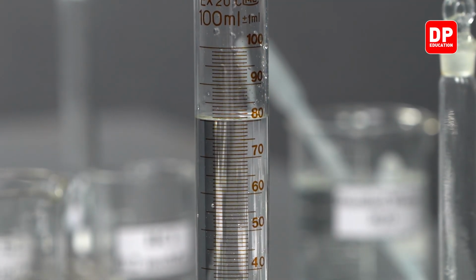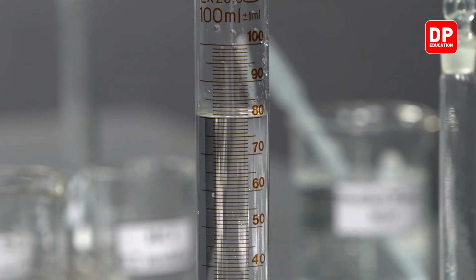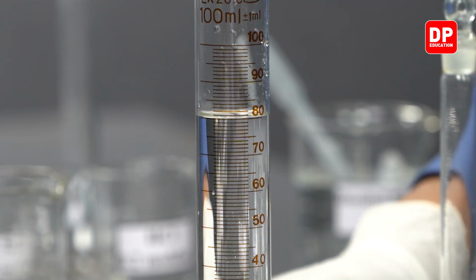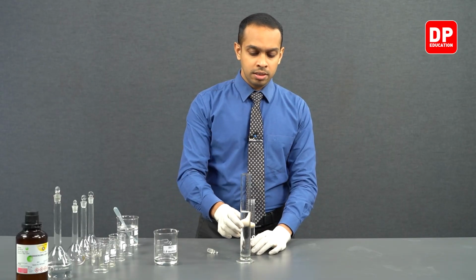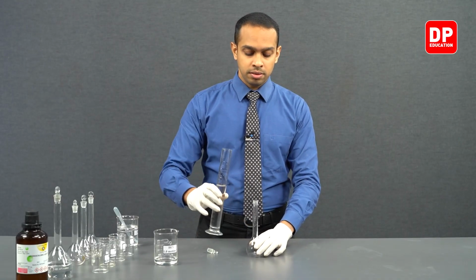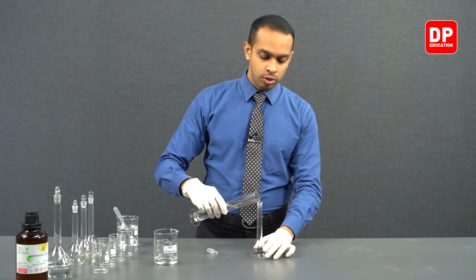Now we have measured exactly 80 milliliters of HCl or 80 cubic centimeters of HCl using this measuring cylinder. Let's add this 80 milliliters of HCl into our volumetric flask.